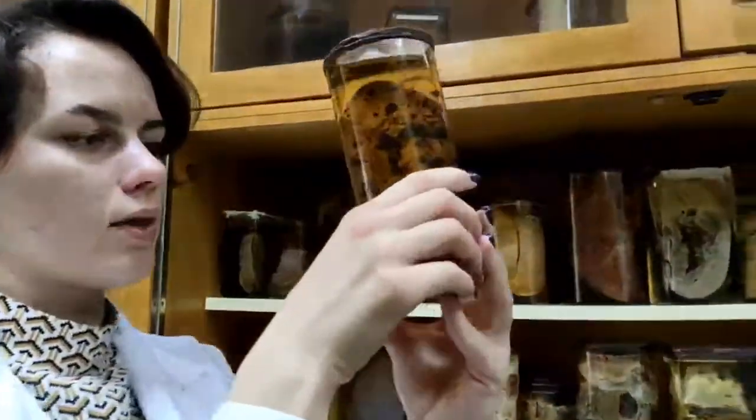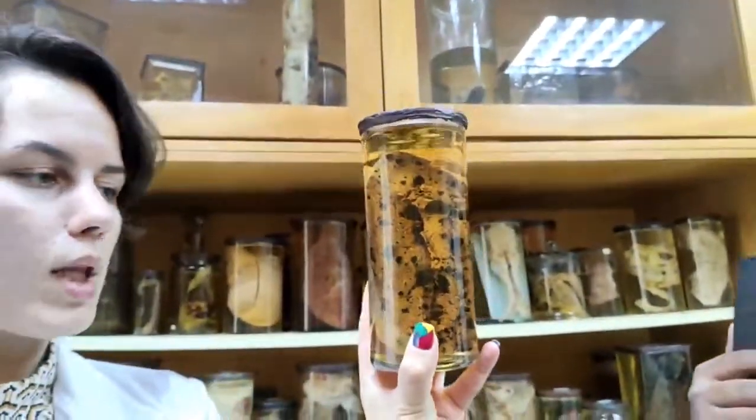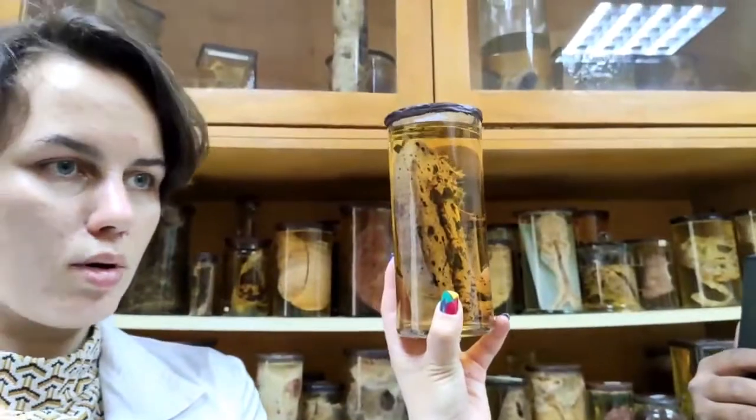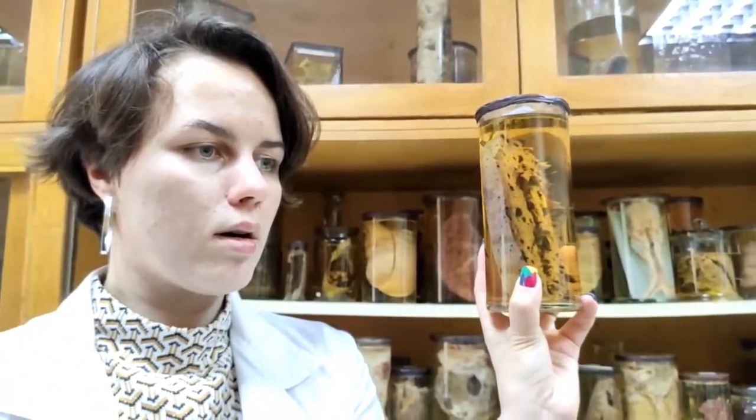The next one is, I guess, liver. Liver with metastasis of melanoma. Melanoma is a malignant tumor. Please don't make these mistakes. A lot of students, when they hear the ending -oma, think about benign tumors. But this is not the case; this is one of the exceptions. And melanoma, as well as lymphoma, is a malignant tumor of melanocytes.